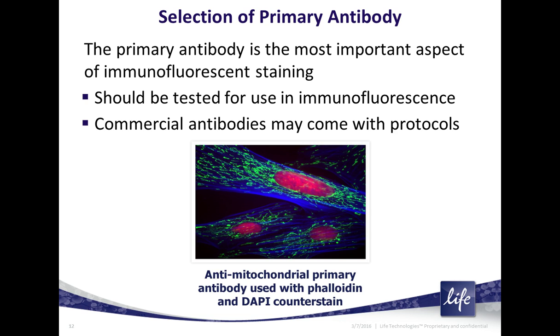Once you've found an antibody against your target, you want to make sure it's been validated to use with your species of cell or tissue and has been validated for your method of imaging, like for microscopy or for immunocytochemistry or immunohistochemistry. Some antibodies have only been validated, for instance, for Western blot. And I can tell you from experience that those that are validated for Western blot don't always work for immunocytochemistry. So you need to be careful and check the information on that, which is usually in the manual for the antibody of interest.